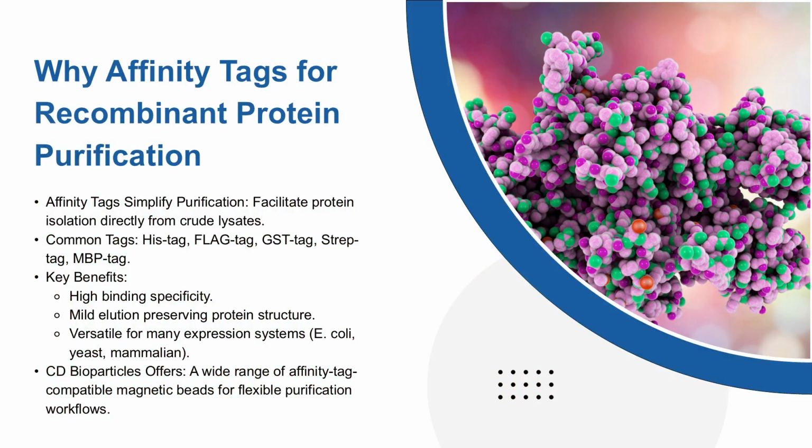Let's start by exploring why affinity tags are so commonly used in recombinant protein purification. Affinity tags, such as His tags, FLAG tags, GST, and Strep tags, are short peptide sequences genetically fused to the target protein. Their primary purpose is to make purification more efficient, selective, and reproducible. These tags bind specifically to complementary ligands, which are immobilized on a solid support, such as magnetic beads.